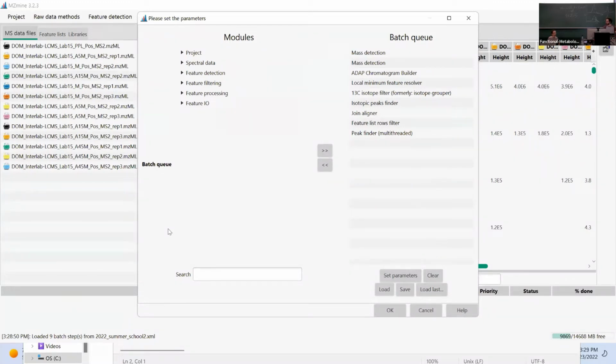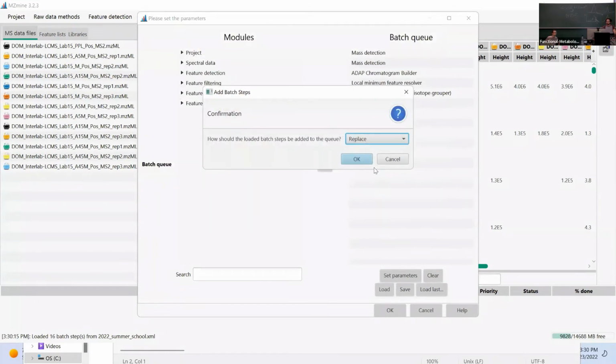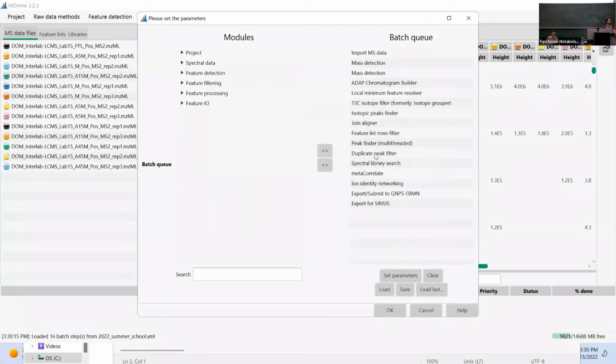But for the sake of proceeding now, I would go back to the batch Robin just highlighted, and then load this. The only thing you need to do is change the file path to actually take the files, because with the different labs, they have different file names on your computer. And then also specify the file path for the output files. All the rest of the settings are preset.